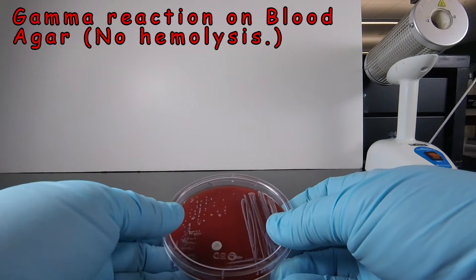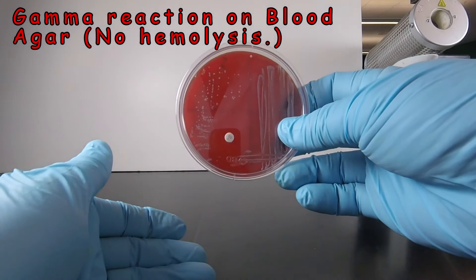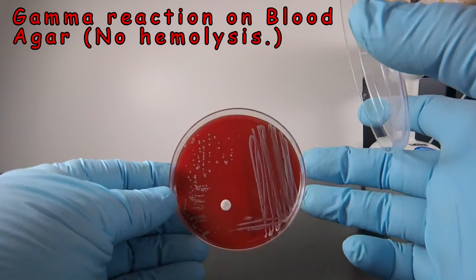Now, although you don't normally want to take the lid off — you just want to hold the plate up to the light to see what's happening — because of the reflections on the petri dish lid, I'm going to remove the lid so that you can see a little bit better here.